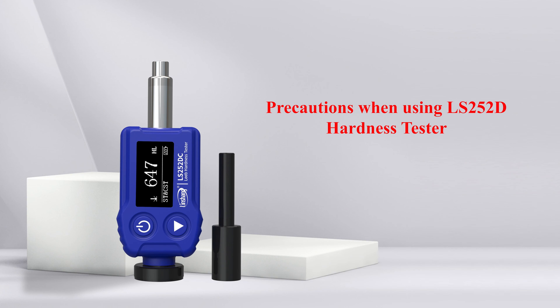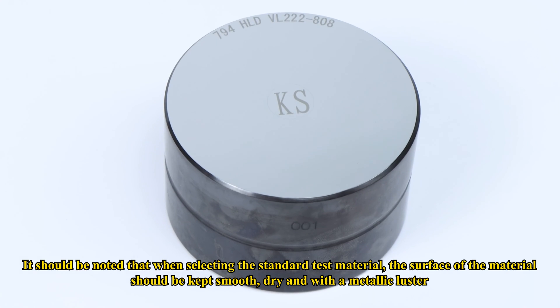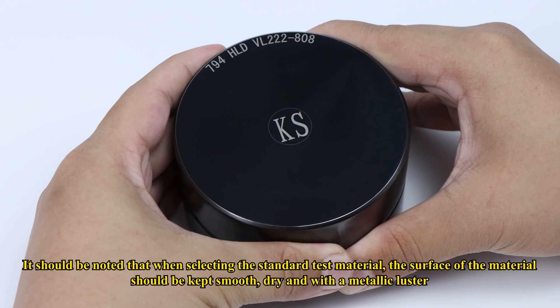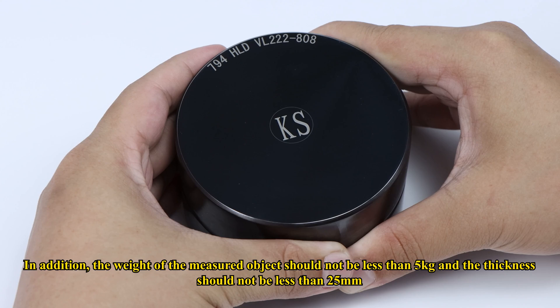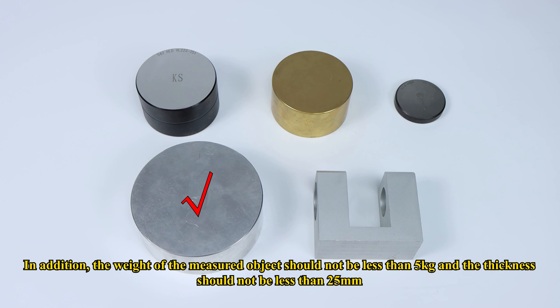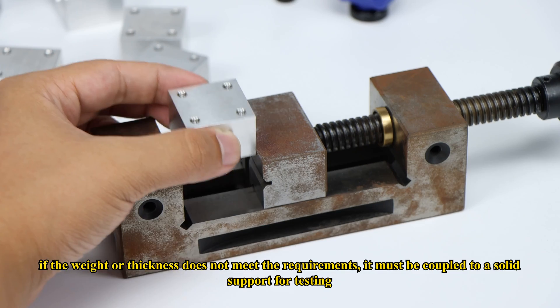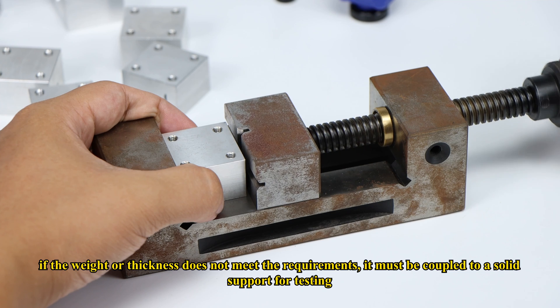Precautions when using the LS252DC hardness tester: When selecting the standard test material, the surface of the material should be kept smooth, dry, and with a metallic luster. In addition, the weight of the measured object should not be less than 5 kg and the thickness should not be less than 25 mm. If the weight or thickness does not meet the requirements, it must be coupled to a solid support for testing.